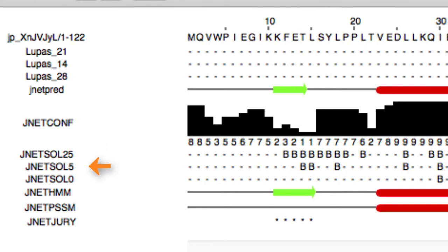JNET SOL 5 highlights buried regions with less than 5% exposure. And JNET SOL 0 highlights buried regions with 0 exposure. B represents buried regions.